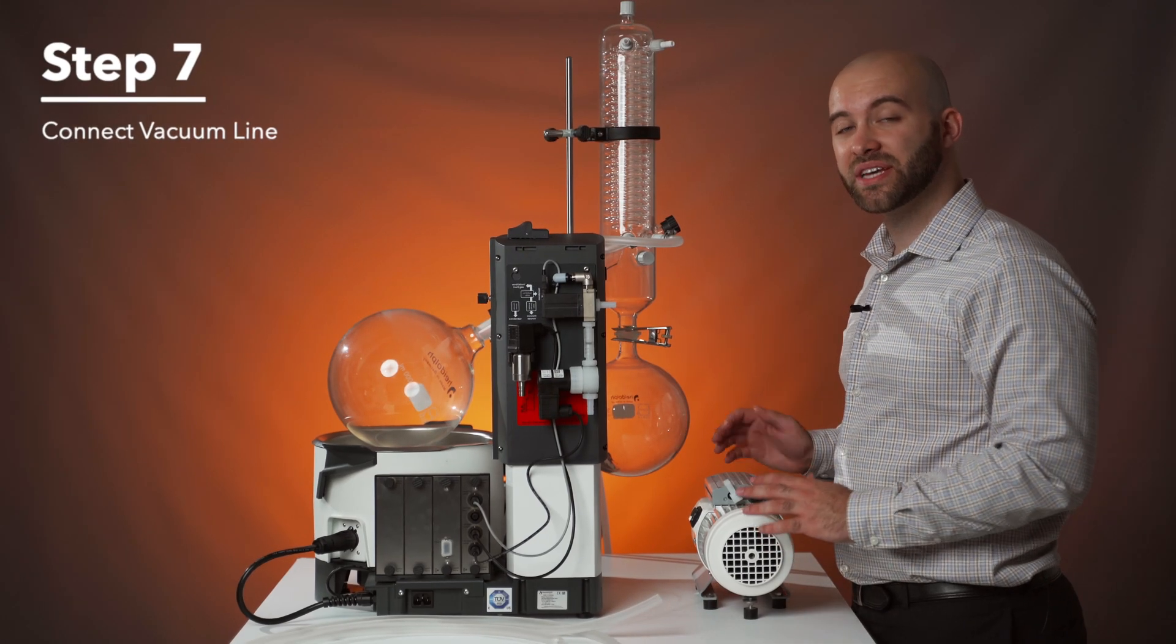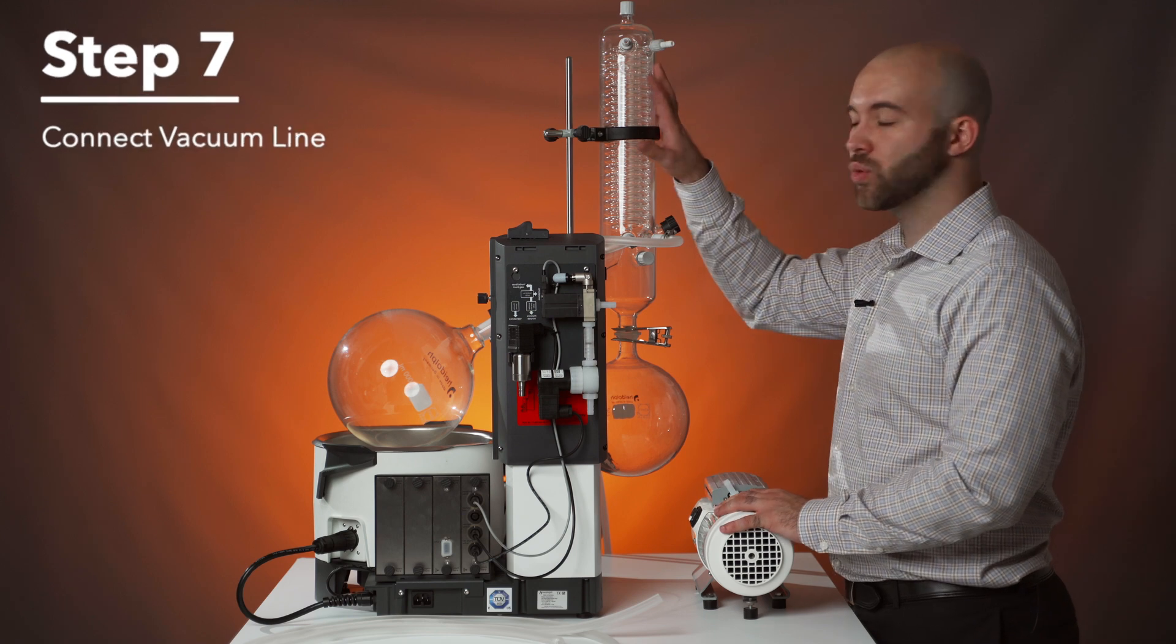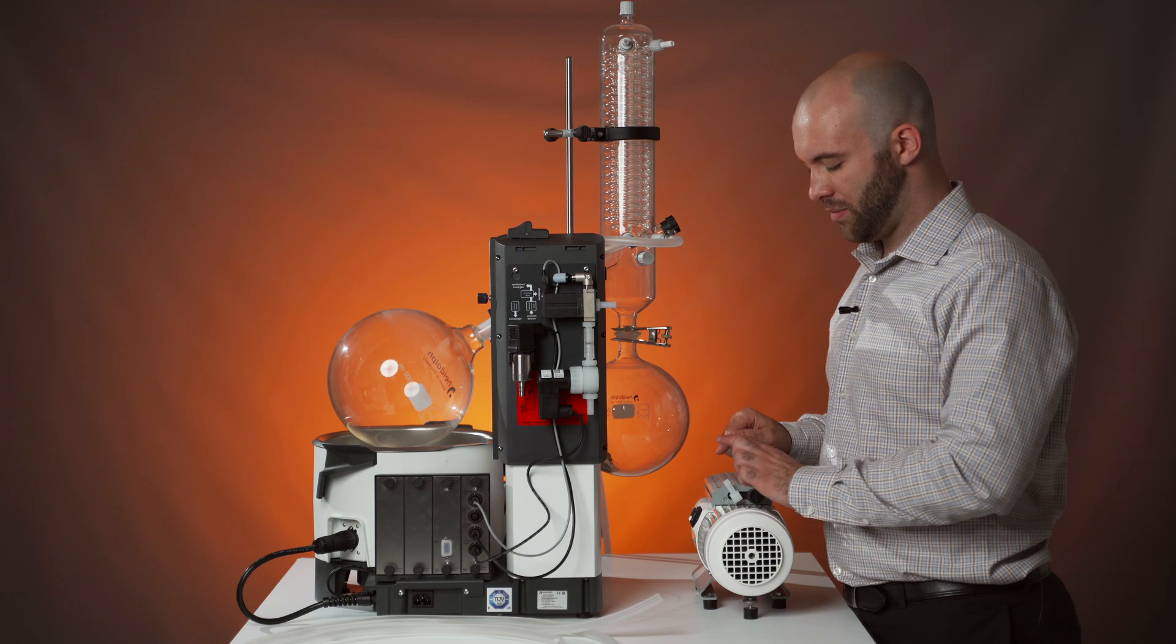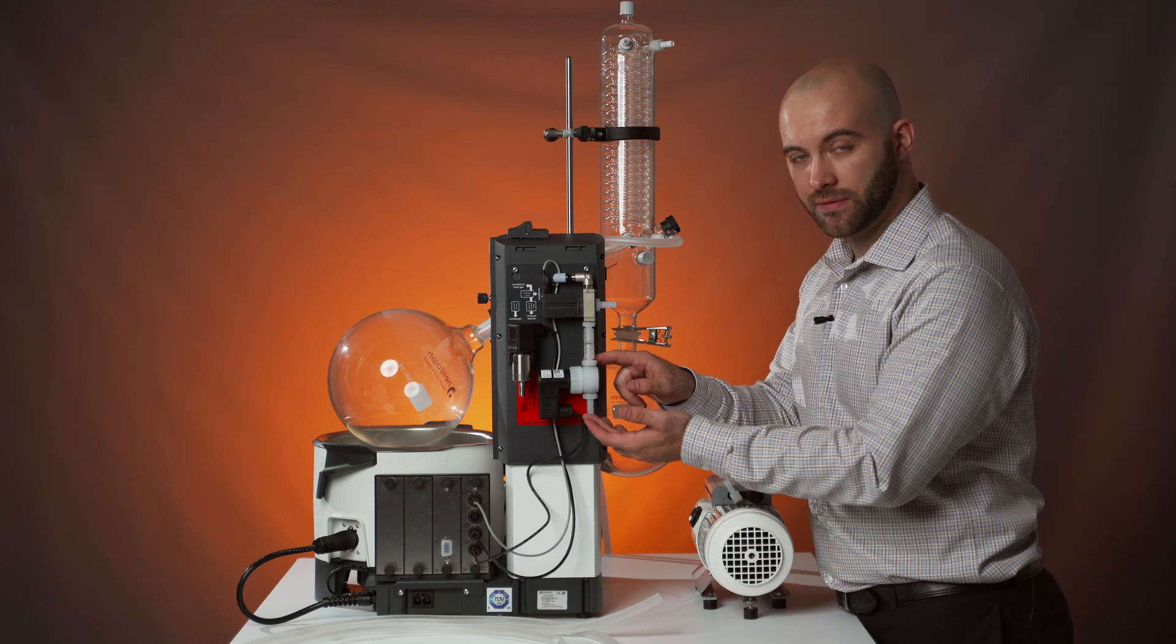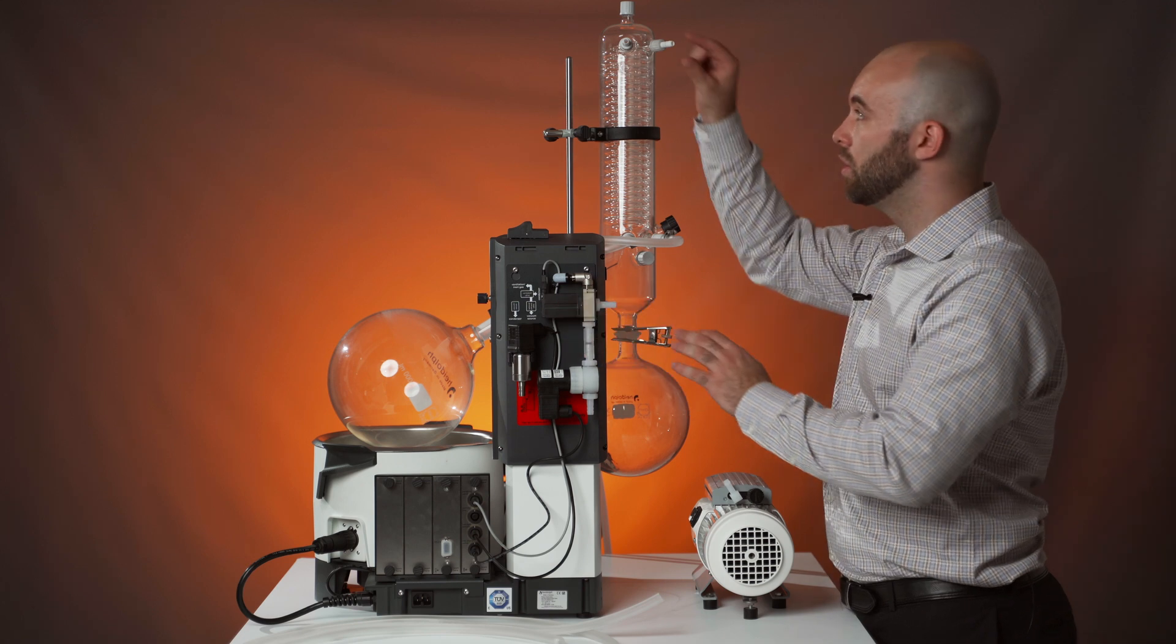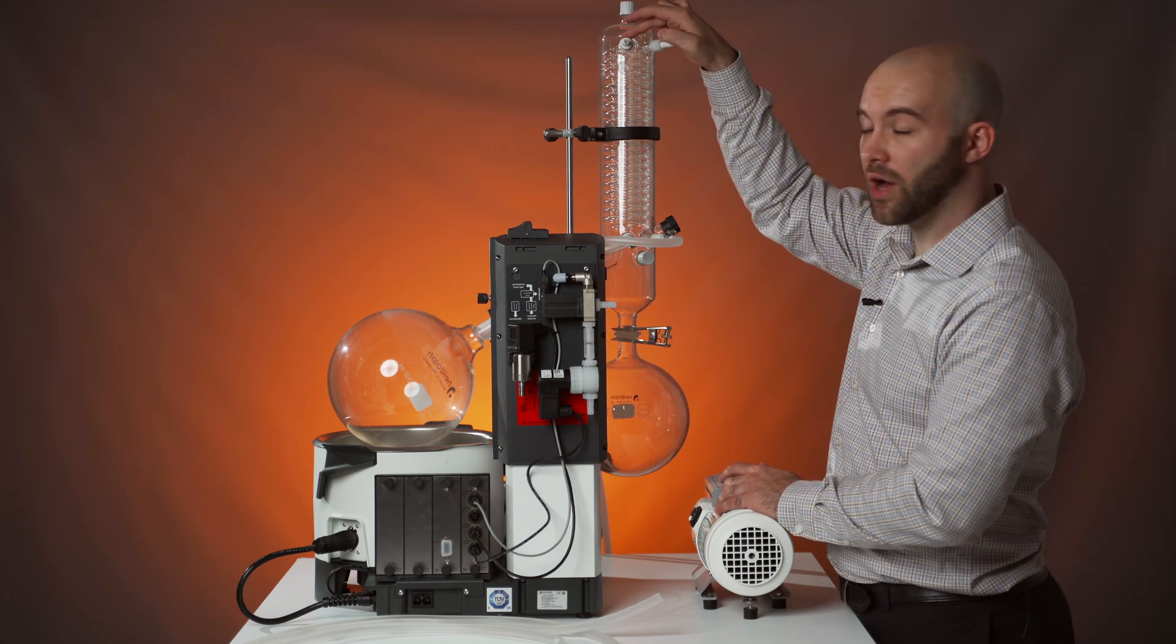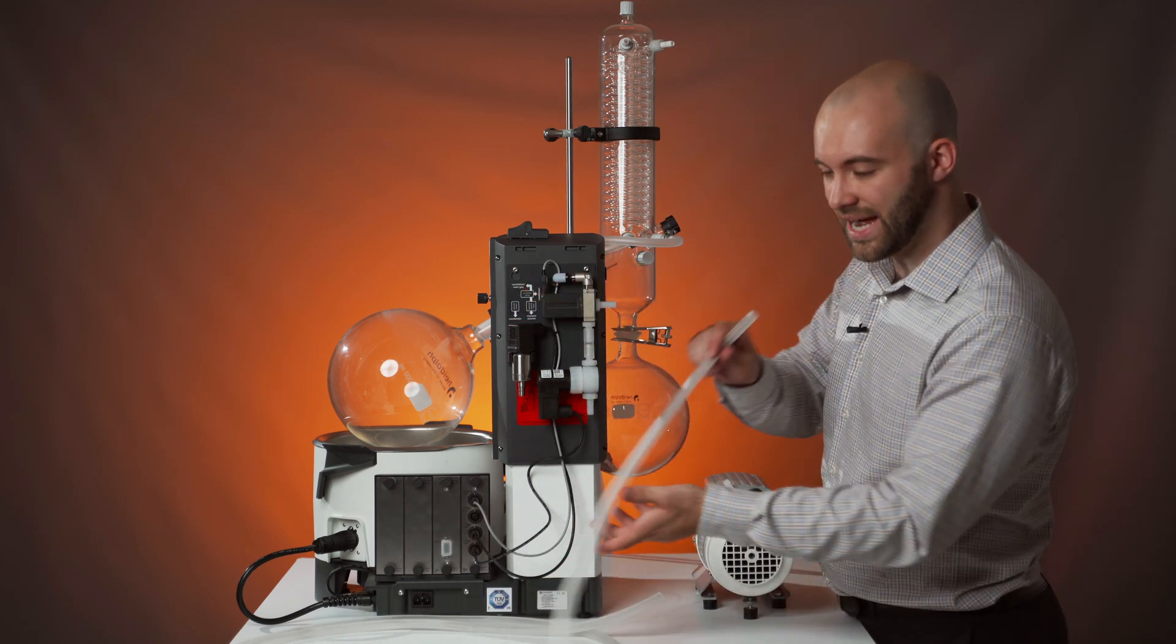Step seven, we'll be connecting our vacuum line from our Rotovac ValveTec to our HiVap condenser. We're first going to start by cutting out three pieces of tubing that will match the length from your Rotovac ValveTec to your vacuum valve, from your aeration valve to your condenser, one of these two ports up here, and from the other port to your vacuum sensor. Once you have cut those, you can start attaching.